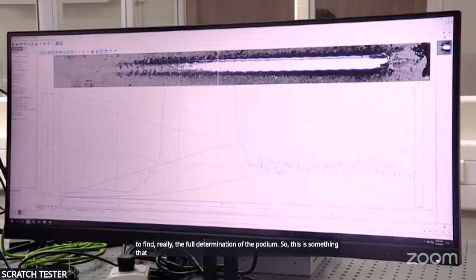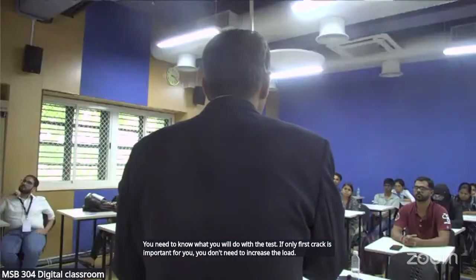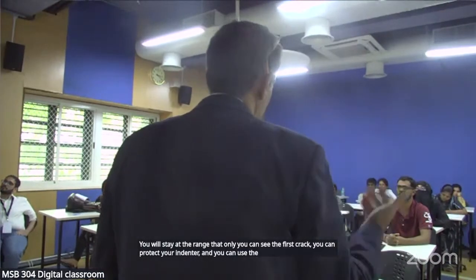This is something that you need to keep in mind: you need to know what you will do with the test. If only the first crack is important for you, you don't need to increase the load. You will stay in the range where you can see the first crack. You can protect your indenter and use it for a long period without any problem.